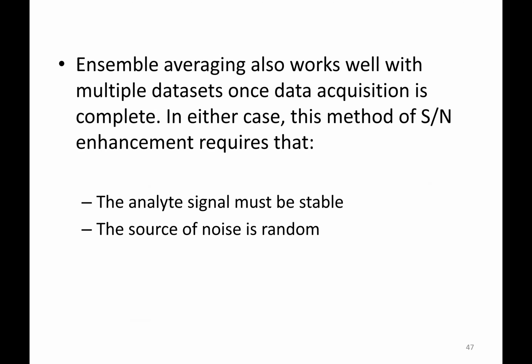whatever is happening during the acquisition of the spectrum, there is stability in the instrument. The analyte signal must be stable. That means the instrument is stable. So that particular analyte signal must be stable, and the source of noise is random. Then that's how you can remove the noise.